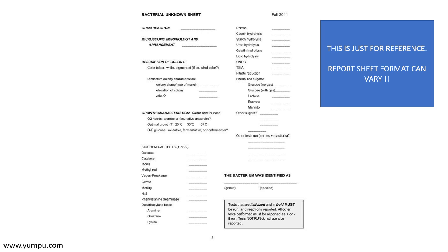Our teachers made us write the words "may belong to", because we are working in a college level lab, so it may happen that human error causes some tests to come out positive, you may slightly get results here and there, and you identify a wrong genus, which may cause a problem. So our teachers made us write that my culture may belong to genus. Never directly write that my culture belongs to this particular genus.